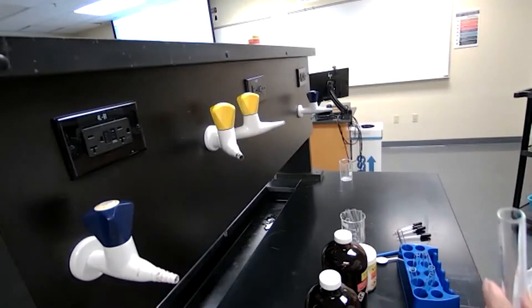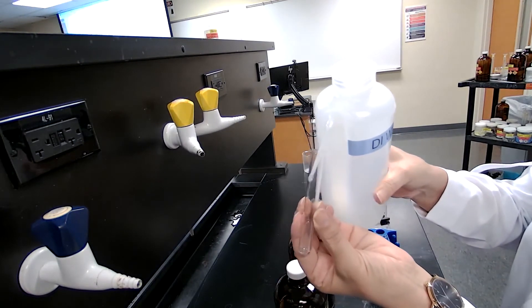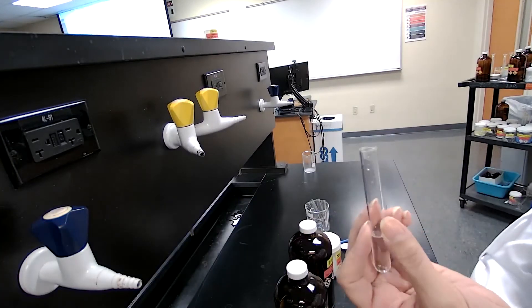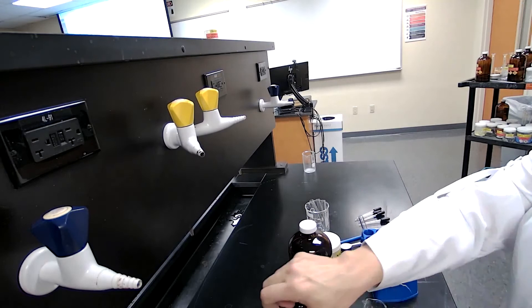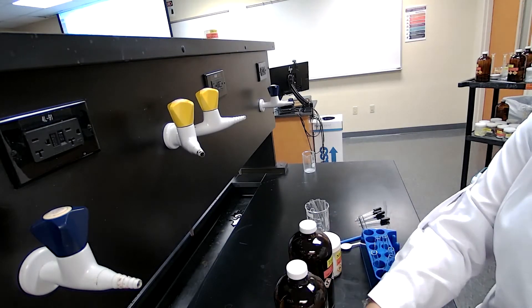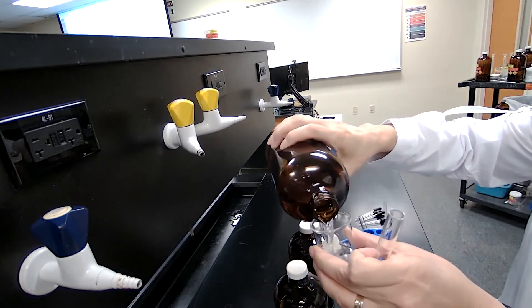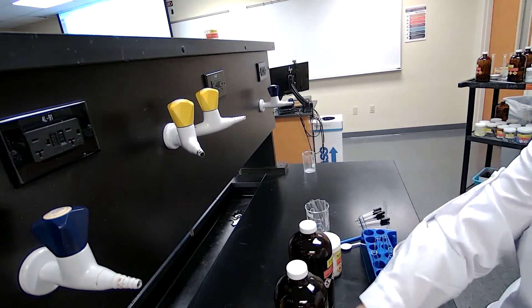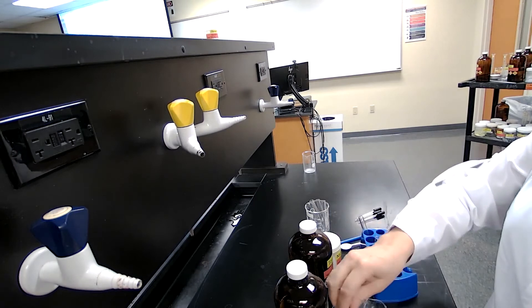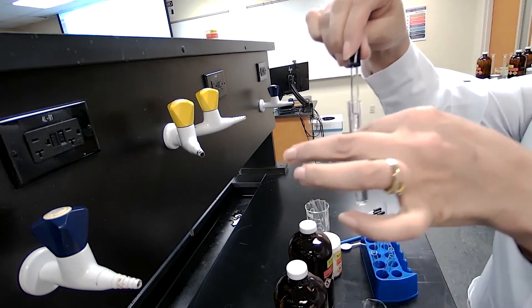Experiment two, part two. Based on the experimental procedure, it says to add water and acetone, so I add about three milliliters of water and I would add acetone. Because the fume hood makes so much noise, I had to take it out of the fume hood to use it on the bench top for recording purposes. I'm going to add one milliliter of the acetone to the test tube.